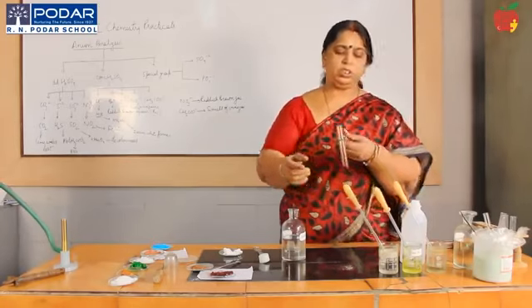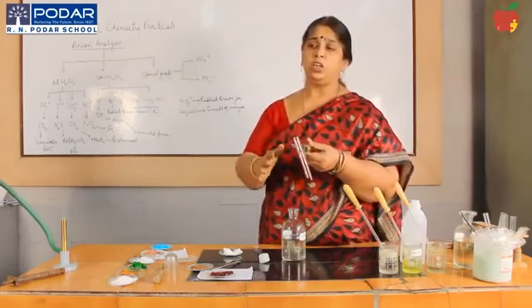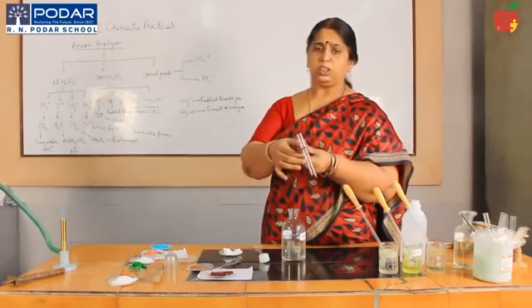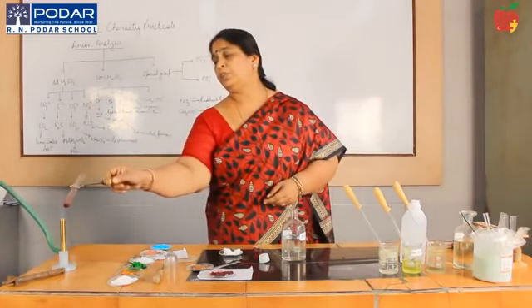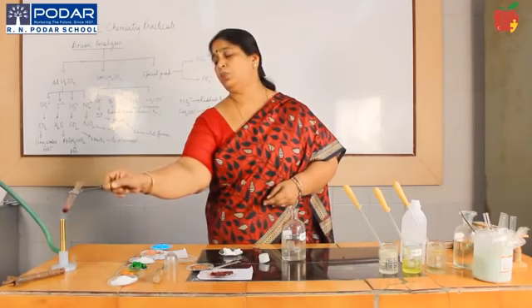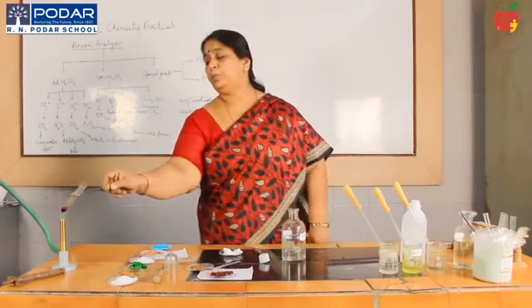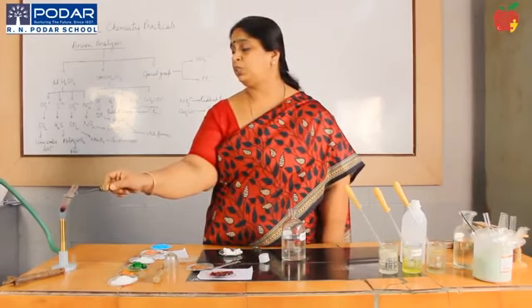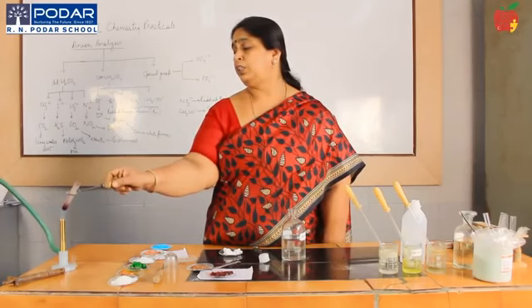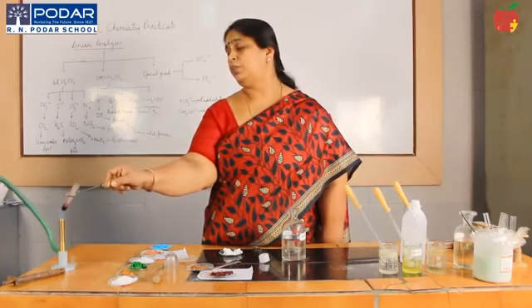Now you see some small fumes are coming out, but as ma'am mentioned, it is not a chloride or anything. So just go for heating of this. Okay, just heat it and you see what's being observed there. When you heat, please keep the test tube in a slanting position away from your face as well as your friend's face, and you can see some gas coming out. Can you see the gas coming out?